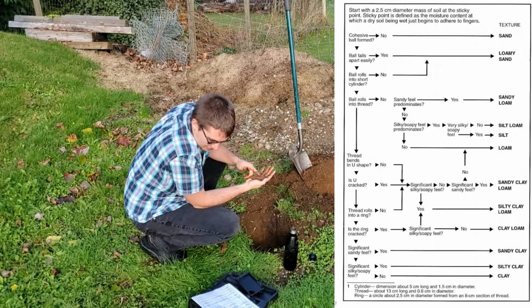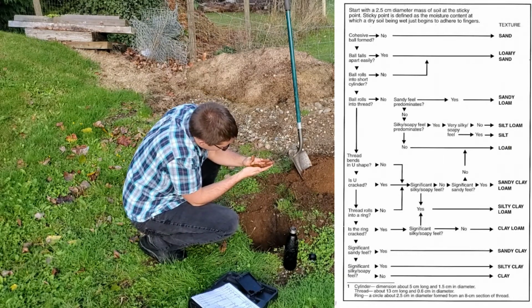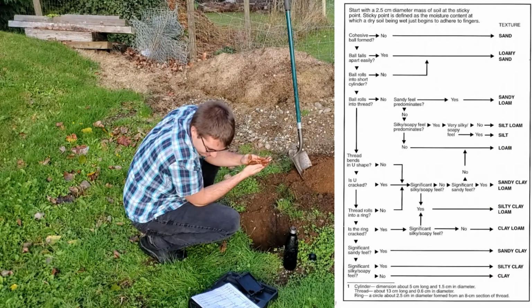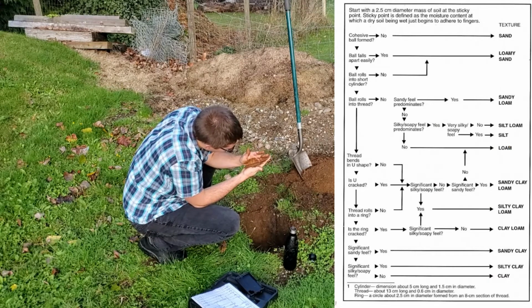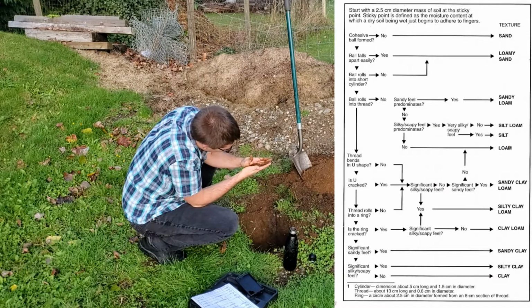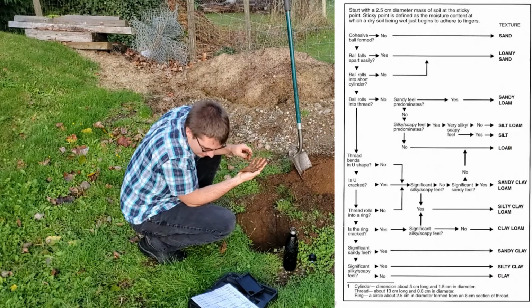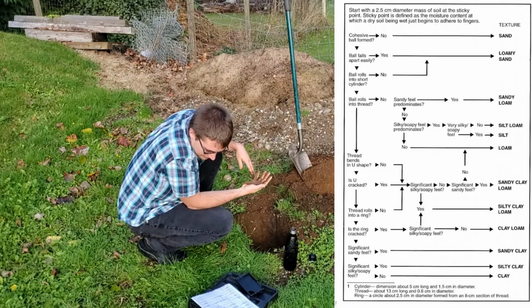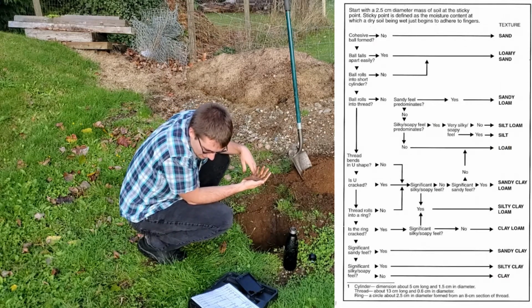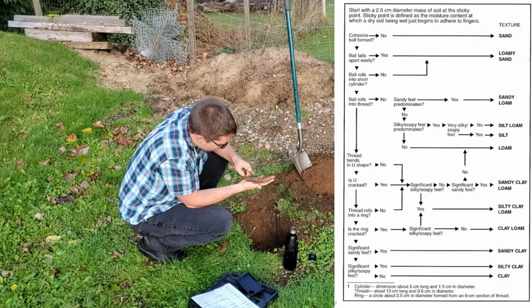Yes, and it rolled into a thread? Probably, I don't think it's going to do that without falling apart. So it does not. So does it roll into a thread?